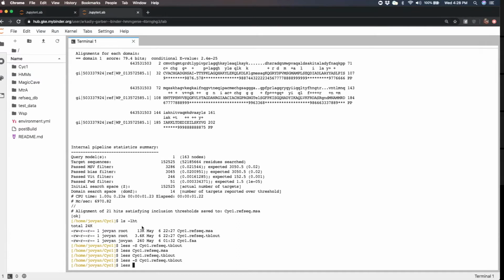Adelaide recommends CView. I haven't used CView, but I just wanted to say that this is a very important point. There are sometimes genes that are put into RefSeq or other databases that have been labeled as being a particular gene. And if they get into your alignment file, they'll have a lot of gaps, and they'll lengthen the sequence that's been aligned, and that's going to mess up your findings with HMM. So I don't know a better way than a visual inspection, and that really slows down the process.